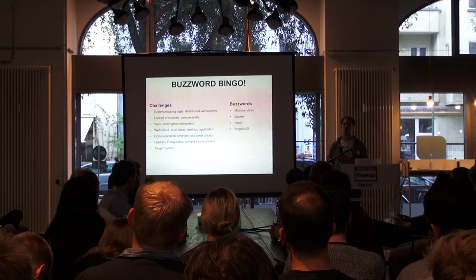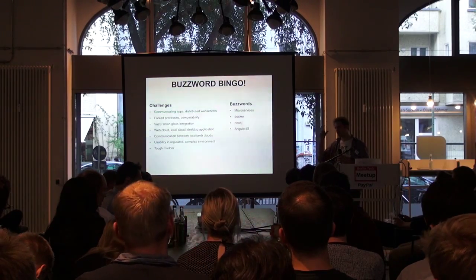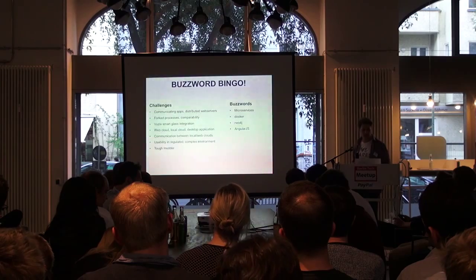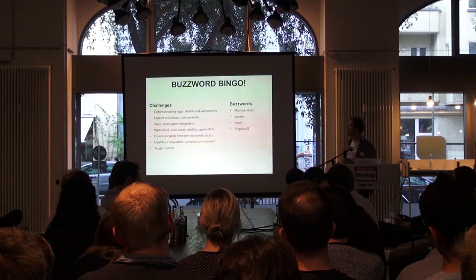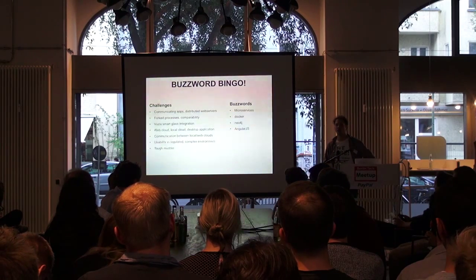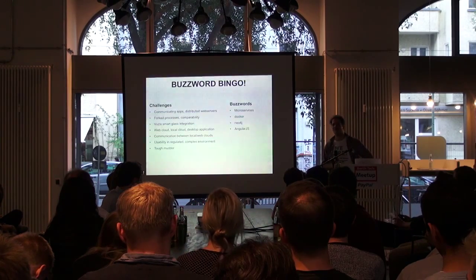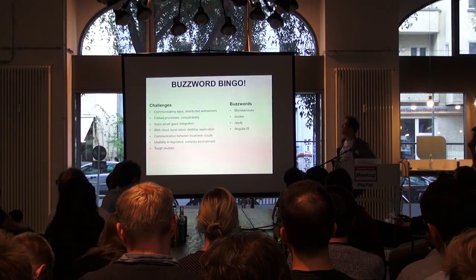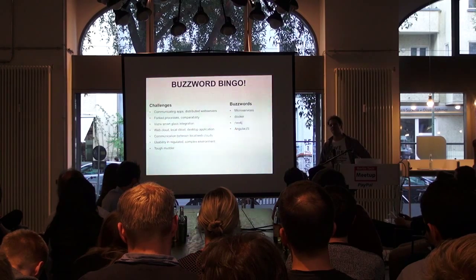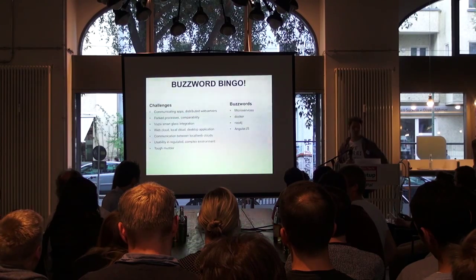There's also a lot about not only helping the researcher to plan and to record their experiments, but also to do them by integrating the processes and instructions in lab glasses, like Vuzix glasses. And of course, everything has to be very usable in a very regulated, complex environment. So these were the buzzwords I have been told to show here, and I hope some feel familiar with that. I have a slight knowledge about them, but that's maybe something you can give us feedback about when you see these challenges, if those buzzwords are the correct ones, right?